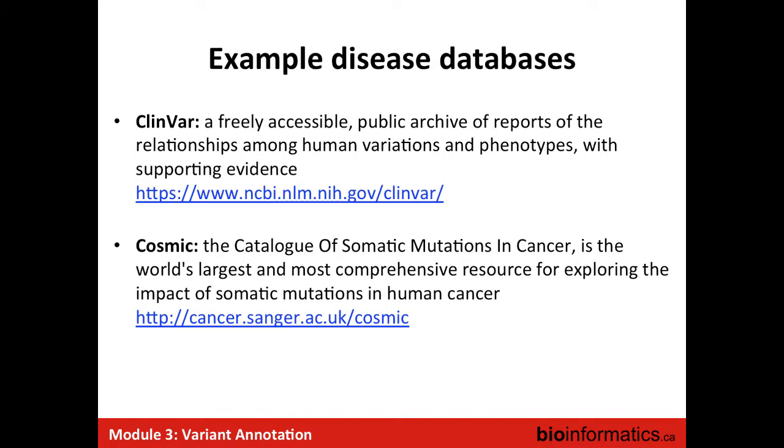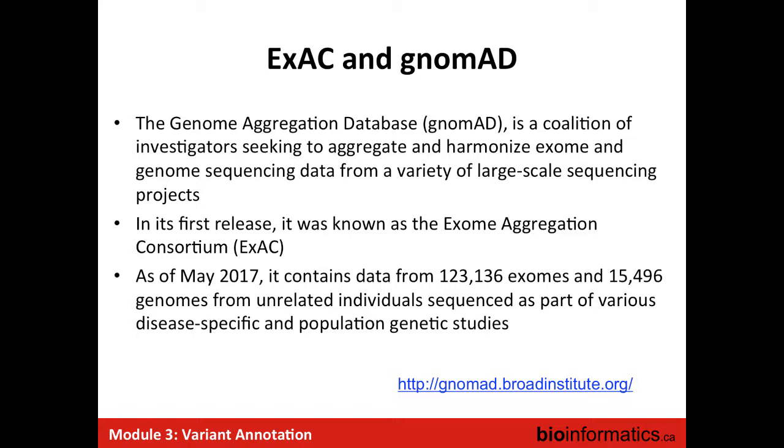Are these people with benign disease? That's right. Or in many cases, just population, right? So, population. Right. How do those multi-platform systems deal with technical artifacts related to different sequencing technologies?